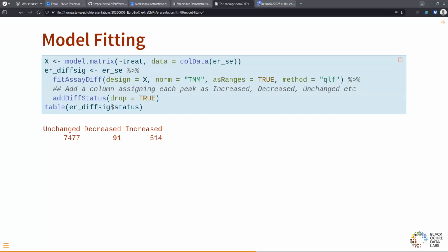Okay. This data set is a very well-behaved data set, so it's just an example of what you can do. The default would be just to use library sizes and not have any of these scaling factors, and that's the best you can kind of do in that setting. What I like to do, particularly in a sliding window context, is Q-smooth normalization.